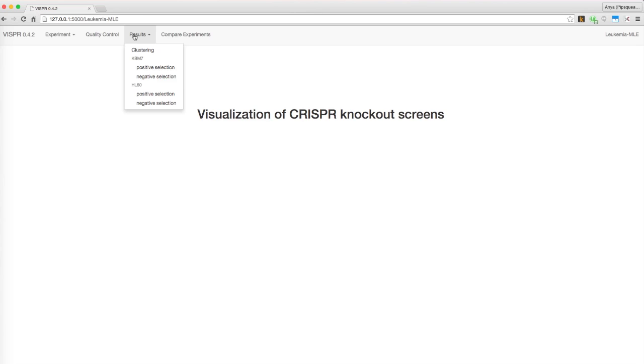Clicking on Visper's results view, a menu pops up, offering positive and negative selection results for each sample as well as an overall clustering visualization.